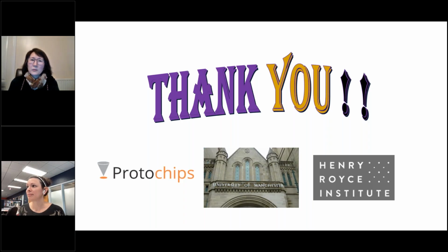Yeah, I think it's feasible. I think yes. You can approach your needle to the 2D material, say nanowires or whatever, and put it over there, and then just retract. But sometimes the thin foil or 2D materials may stick on your needle and it won't go away. Then you need to try again. That means you place, say for example, the nanowire back again, and then you lift up, and then again you may have a few tries until it stabilizes, until it really drops on the surface.